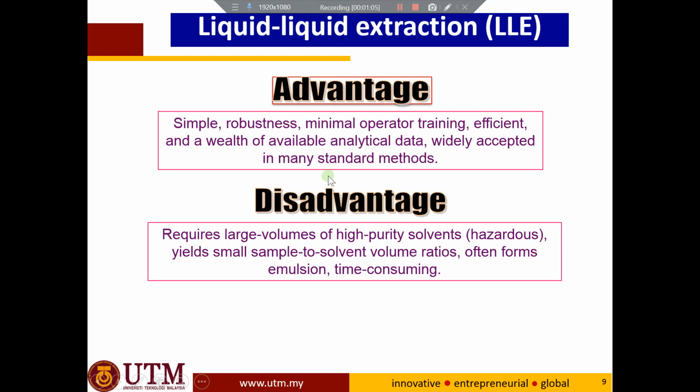Alright. The disadvantage is that it requires a large volume of high purity solvent. This is the problem because we use a huge amount of solvent and we deal with hazardous solvent. So that's why many researchers and scientists nowadays have already moved to small volume liquid extraction, which they call micro liquid extraction. You can find a lot of papers that have been performed on micro liquid extraction.